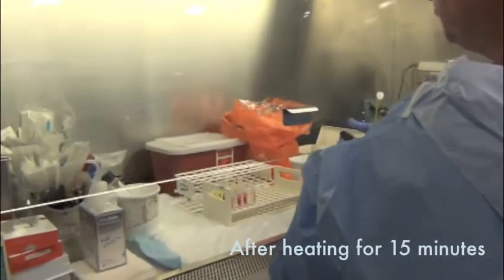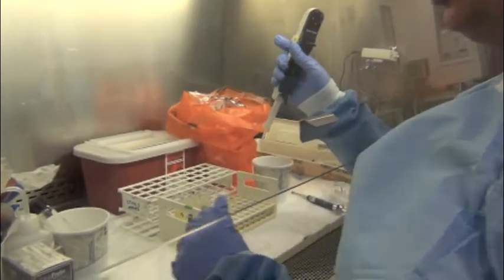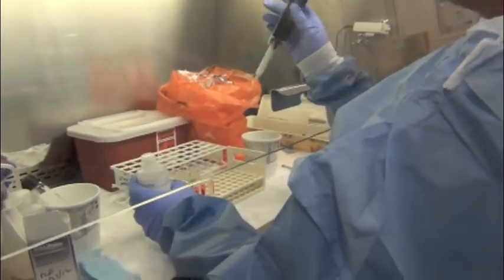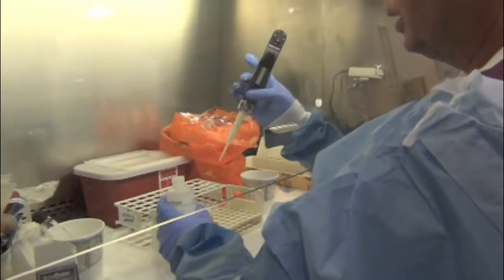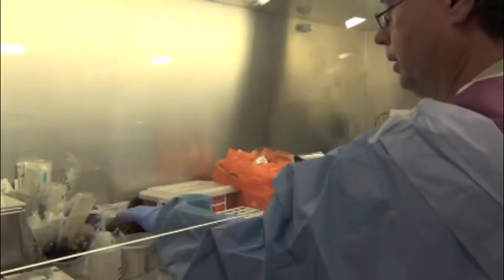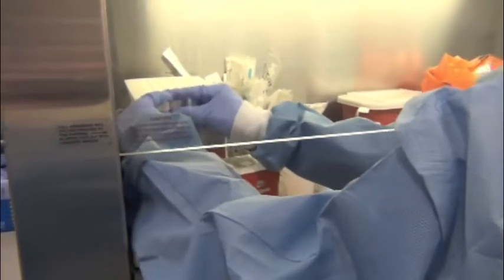We're going to add 300 microliters into each tube of our selection reagent. And what does this reagent do? This selects out the unhybridized probe that we have in there. So it's selecting out everything that hasn't been hybridized. Then we're going to vortex them over here. This is kind of an important step. We want to make sure we vortex it real well.